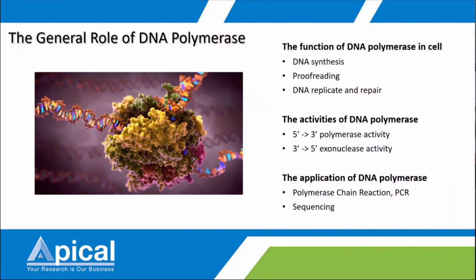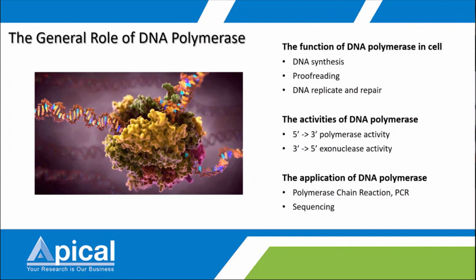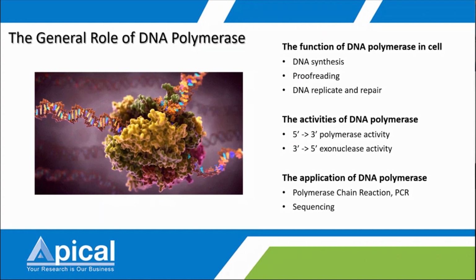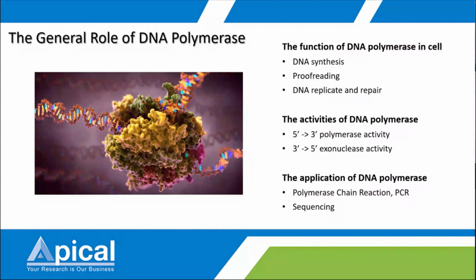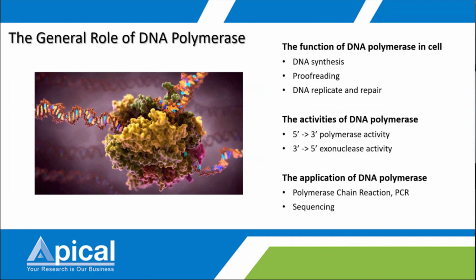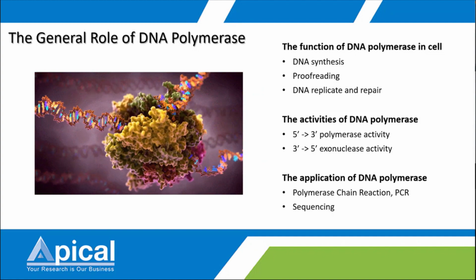All these functions of DNA polymerase are crucial for genetic inheritance, cell replication, and the overall growth of the organism. Meanwhile, these two activities possessed by DNA polymerase are essential for molecular biology applications, especially PCR and sequencing.